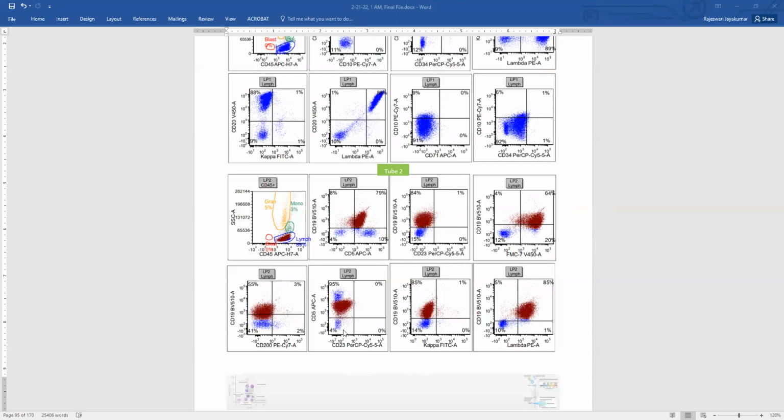This is just a repetition. CD5 positive cells are negative for CD23, and again in kappa lambda they show that they are all lambda light chain restricted. So in this one, there are different types of reporting. Some people are confident that this is a CD5 positive lymphoma that doesn't have anything phenotypically like CLL.